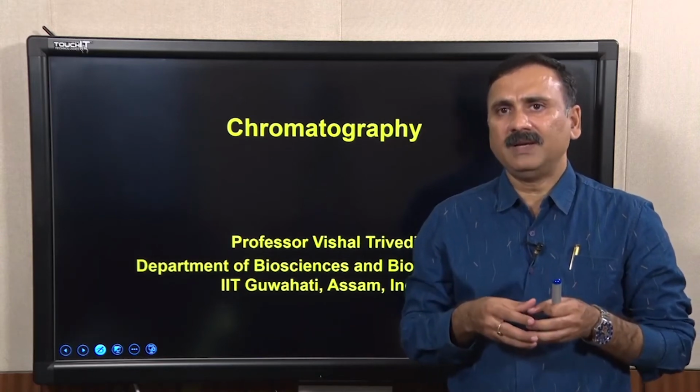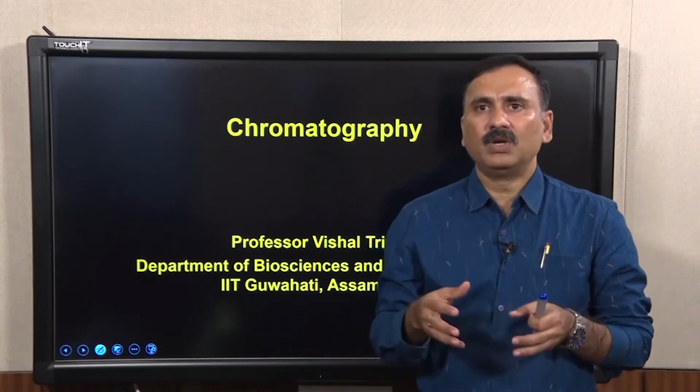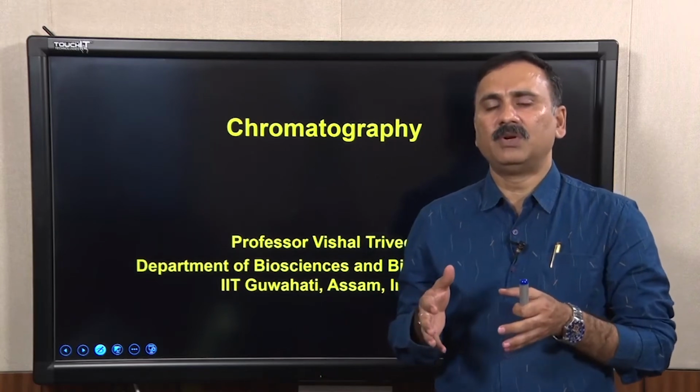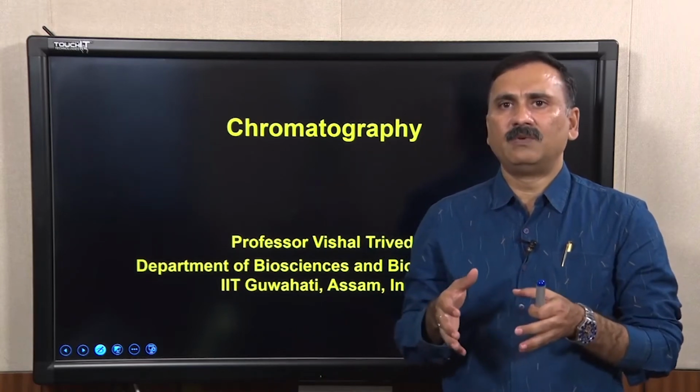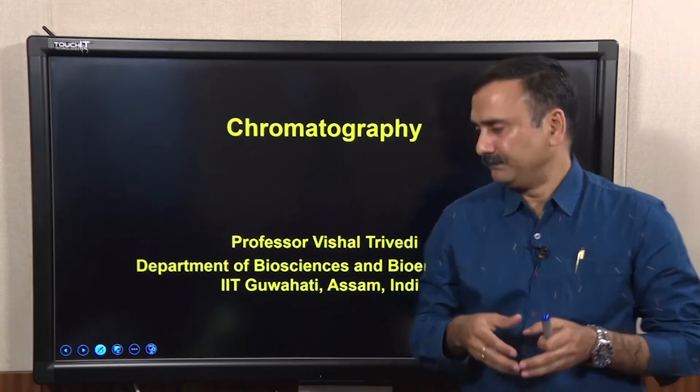Chromatography is a technique which allows you to separate molecules, and when you have a crude mixture you can purify the molecule of your interest. So, let us discuss chromatography.